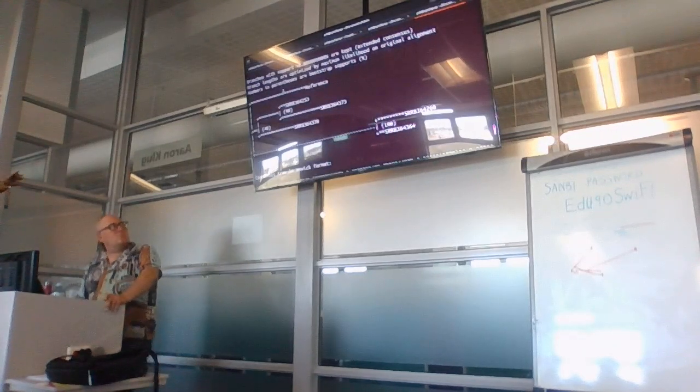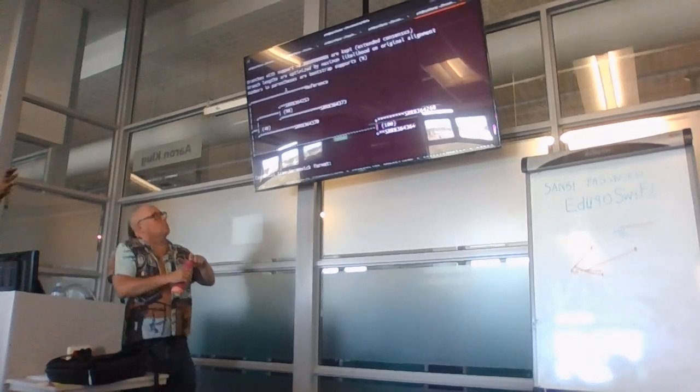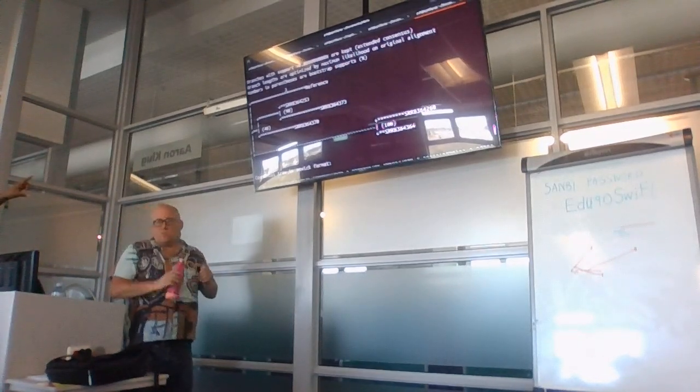But as Peter is saying, in this case, the topology here doesn't matter. I wouldn't care about where the reference is. It's a computational process. You have to place a reference somewhere. It's completely meaningless, but it does show that indeed there are loads of differences between these samples and the reference. Yeah. Okay. There's no relatedness.